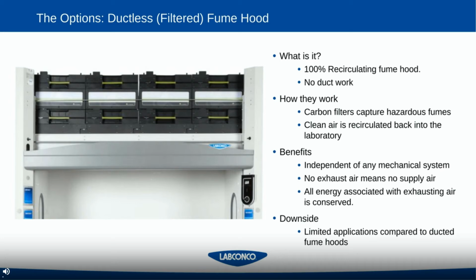It's important, though, that you understand that these hoods, when operated correctly, can still be a safe option. They will have a carbon filter or some sort of media. Carbon's just the most popular. As hazardous fumes are coming through those filters, the chemical is captured, and then clean air is recirculated into the lab. So nobody in the lab is exposed.